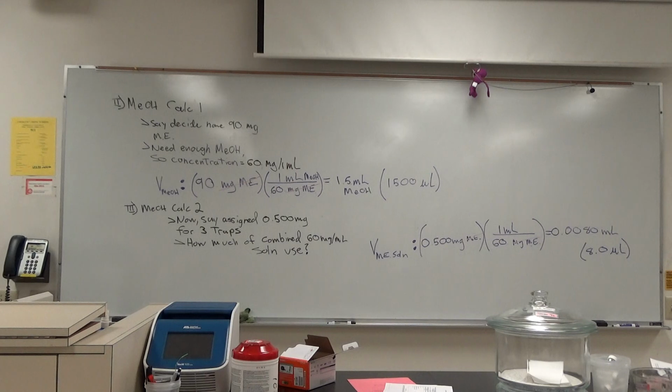Let me see, 2 things I want to double check. Here's where you can see the starting material, which is eugenol, and the product, which is methyl eugenol. Here is our methanol. Okay. So let's say, I better go off camera.